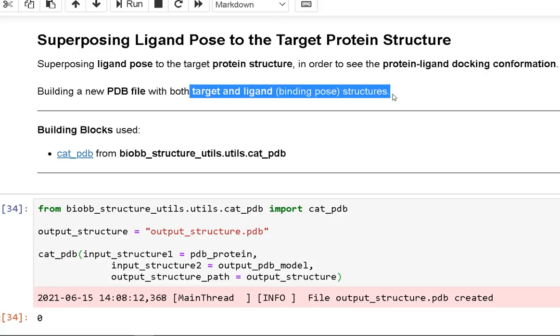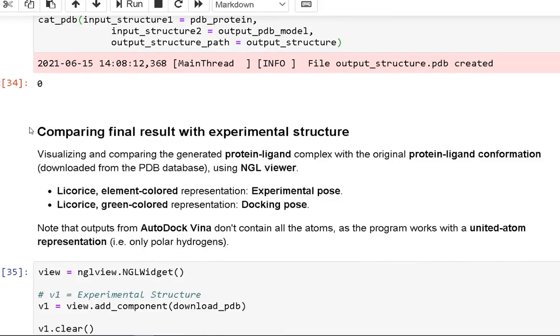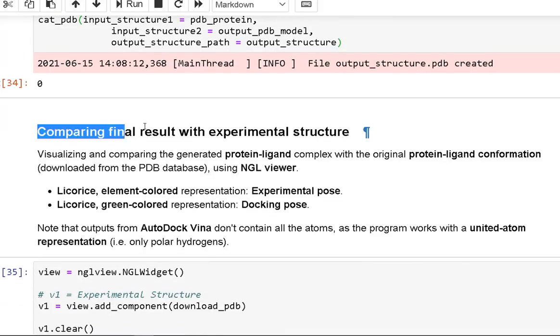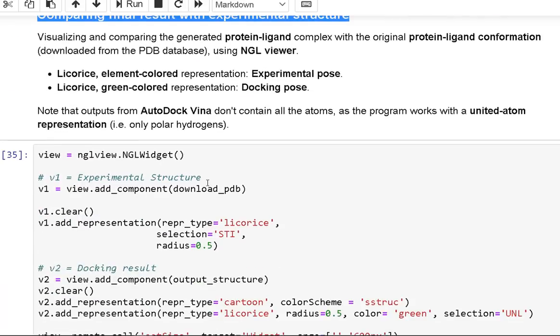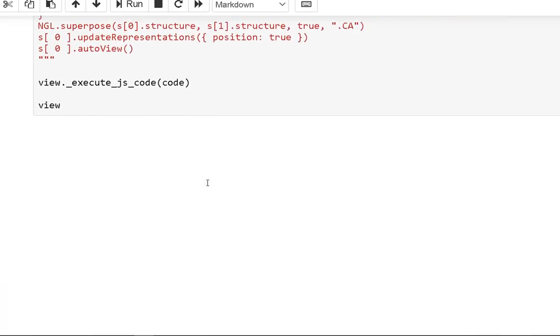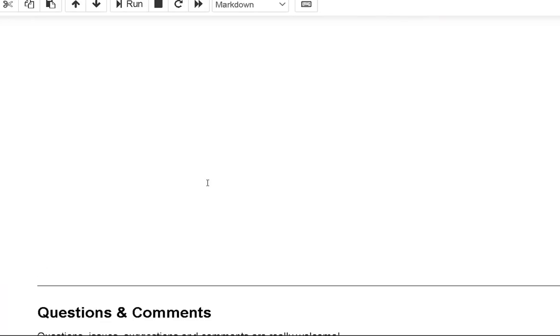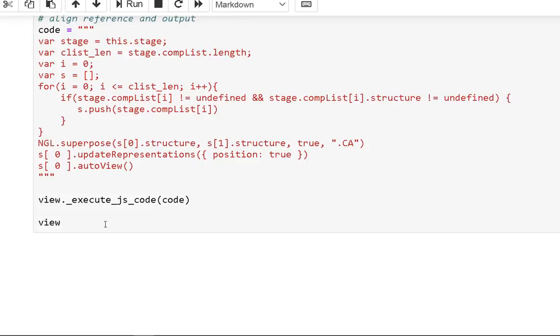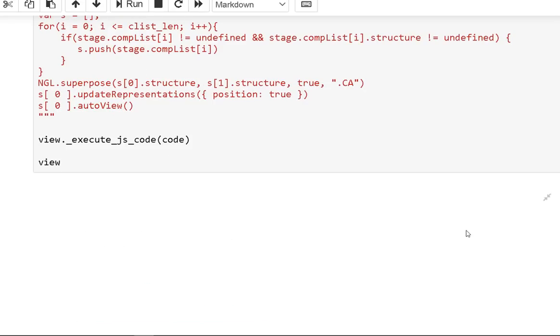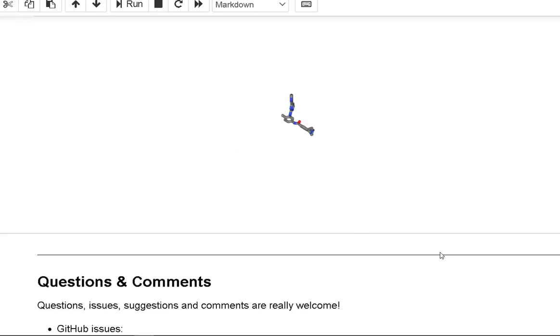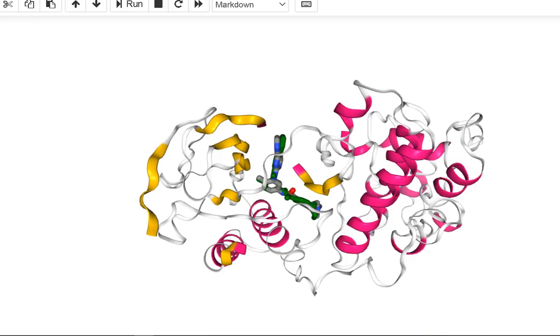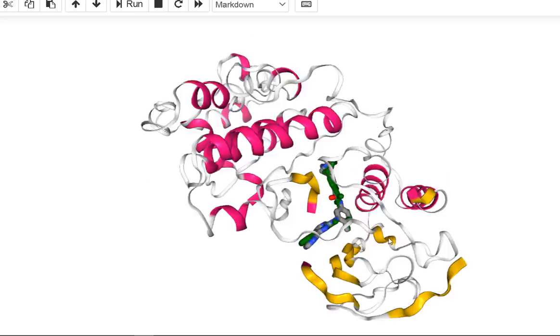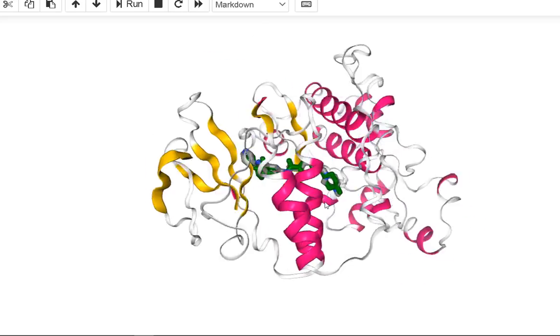Comparing the final result with the experimental structure: using the NGL viewer, visualize and compare the produced protein-ligand complex to the actual protein-ligand conformation. The experimental pose is shown with licorice element-colored representation, while the docking pose is shown in licorice with a green-colored image.